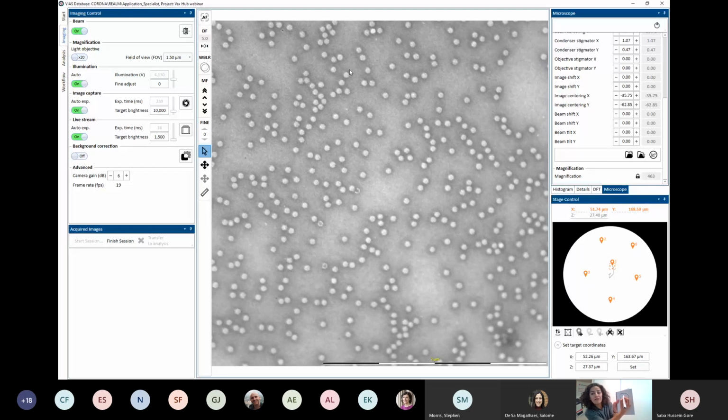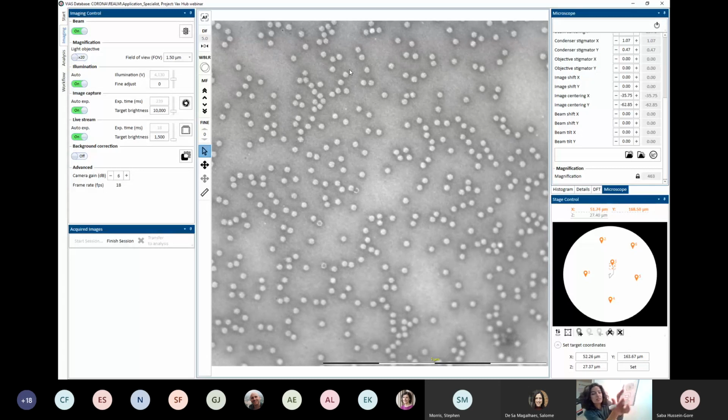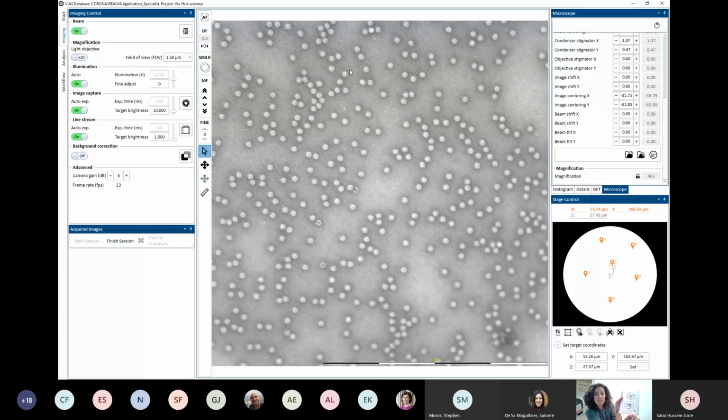The one that we have is, as I said, a 400 mesh. So even if one of them breaks, you can hopefully always go to another. But sometimes there is a grid type used in thin sections where you just have one really big hole. If you damage this, then you've basically broken everything.